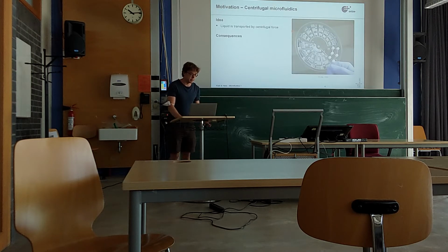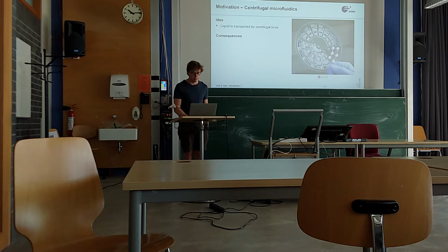So let's start with the motivation and the idea. On the right-hand side, you can see a microfluidic cartridge, which was developed by one of my colleagues here at the institute. And this is really the basic design that you often see in centrifugal microfluidics. It resembles a disc that you probably know from DVD players, or if you're a little older like me, from CD players.